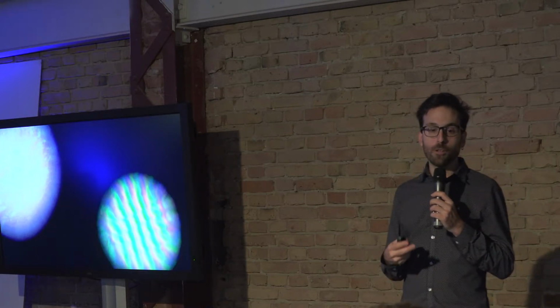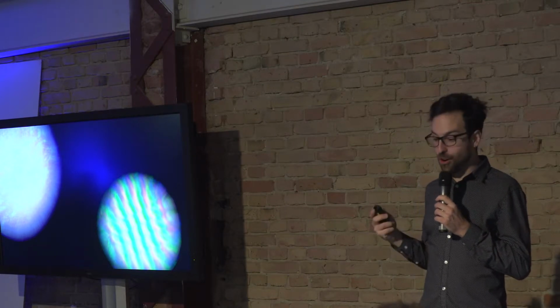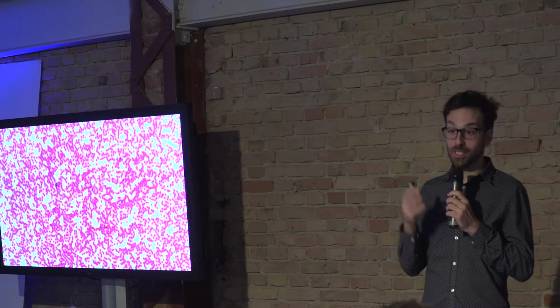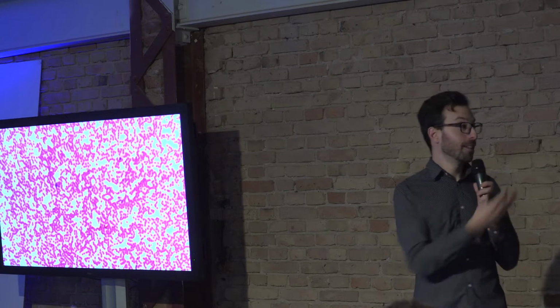So first I built an AIScope. This here on the left side should be a blood sample, and as you can see, that's horrible quality. So I saw that I had to create my own microscope. First I went to Amazon and bought a cheap Chinese microscope, which was aiming to have 1000x magnification, which is what you need to see malaria. But obviously it was a low quality Chinese microscope and I could only get 200x. You could see the cells, that's the same sample, but you cannot see inside.